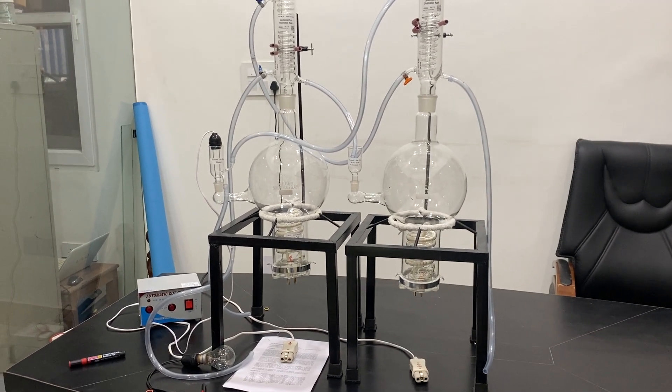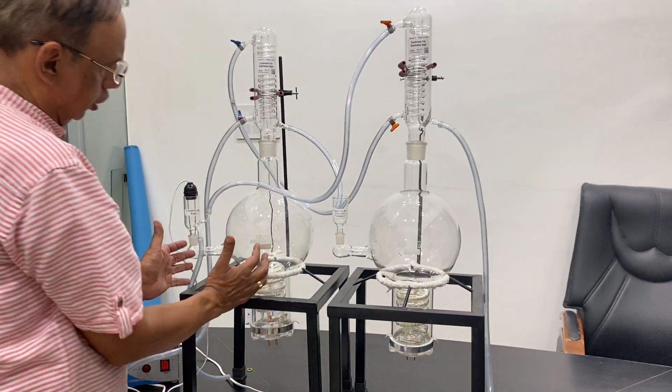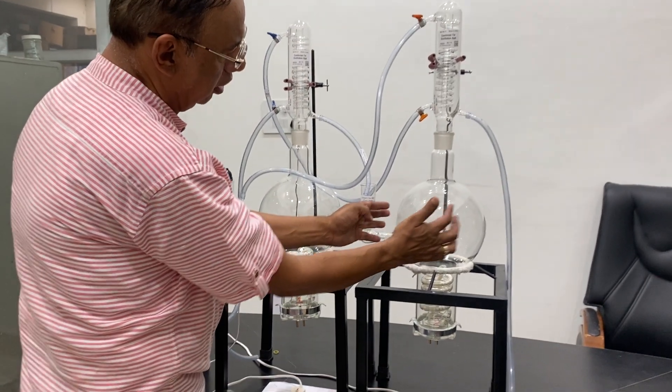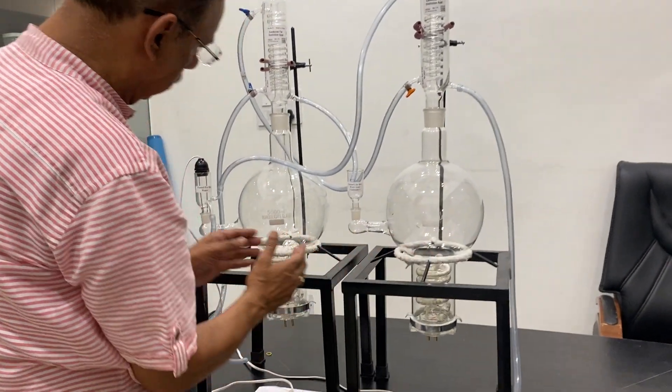Welcome to a video by Agnon. This is a double distillation automatic plant. This is one section and this is the second section. Distilled water from this section will go into the second chamber. When it is filled, it will make another distillation and then you can collect this distillation from the second tube.